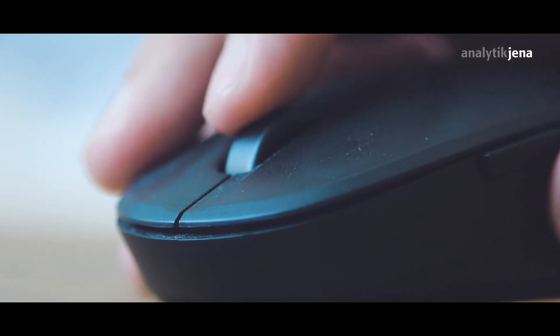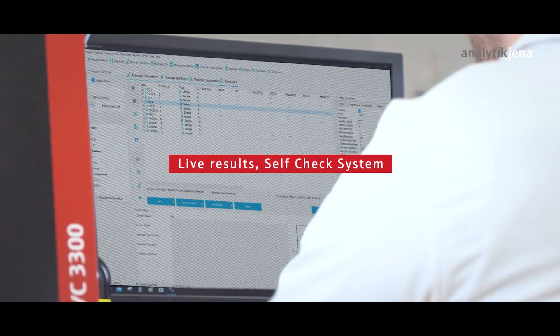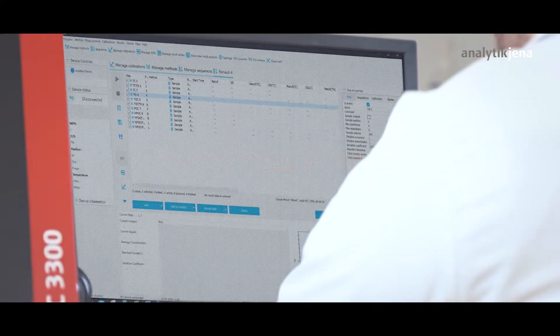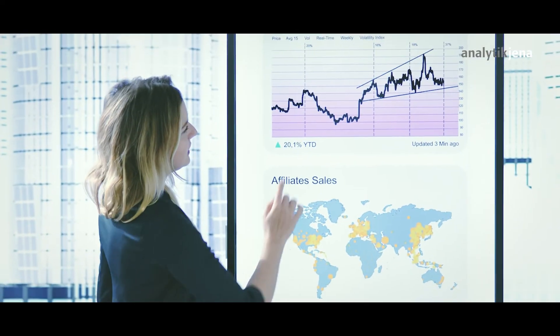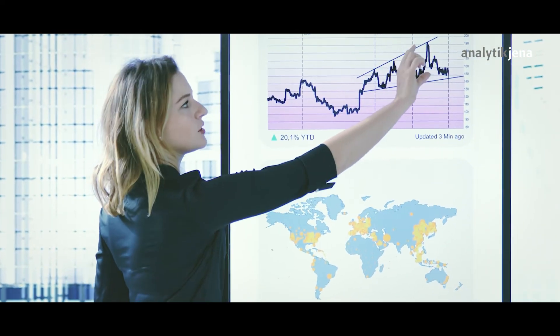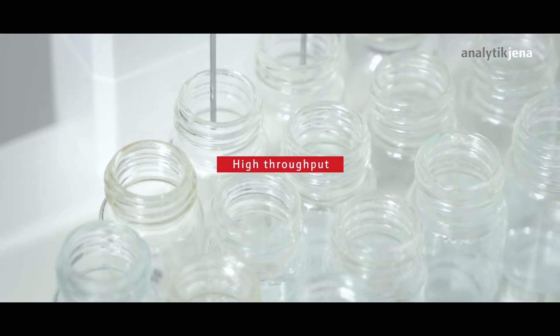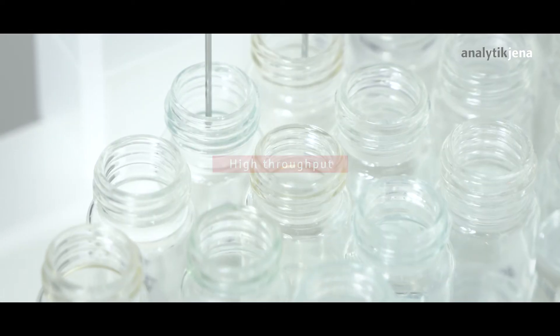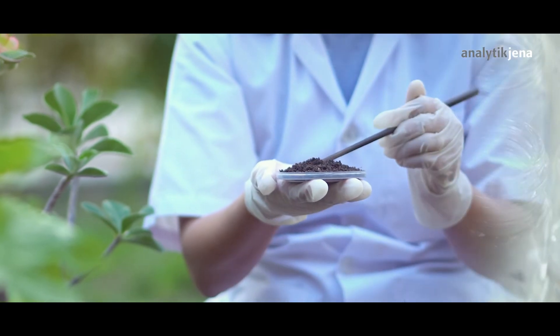With an intuitive software that gives you full overview at any time. Discover a TOC analyzer which is a sustainable long-term investment in your lab. Not only profitable, but future-proof.